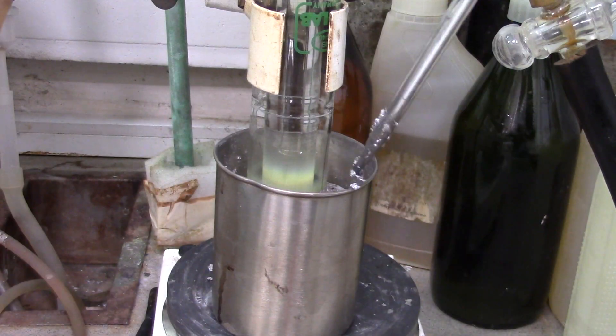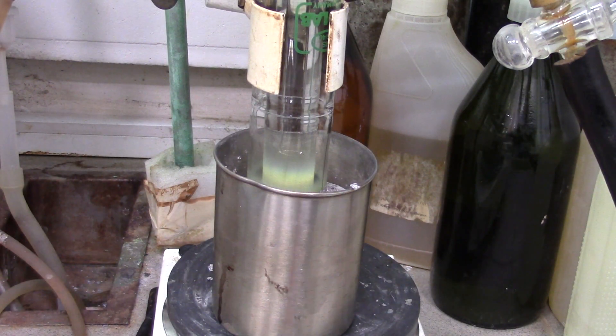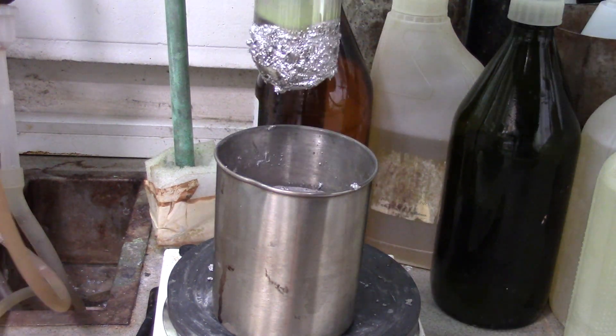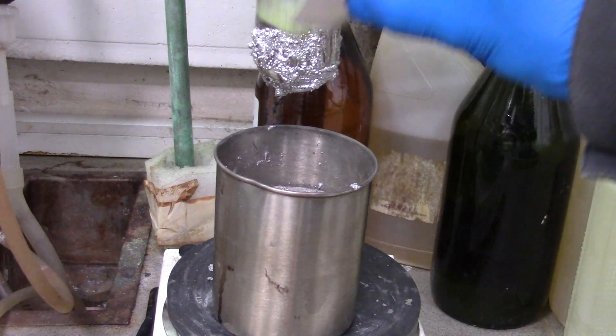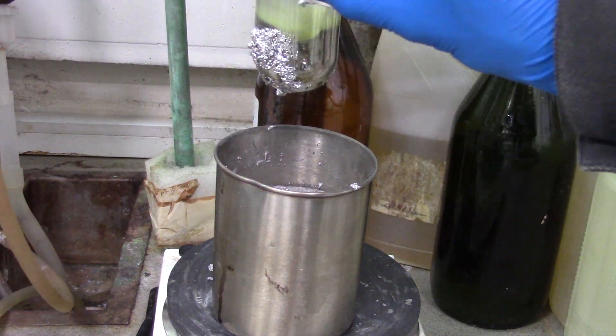After sublimation process is gone, remove the thermometer and put off a sublimator from bath and let it cool down. Further, remove whole wood alloy from it. I will use an used aluminum foil sheet.